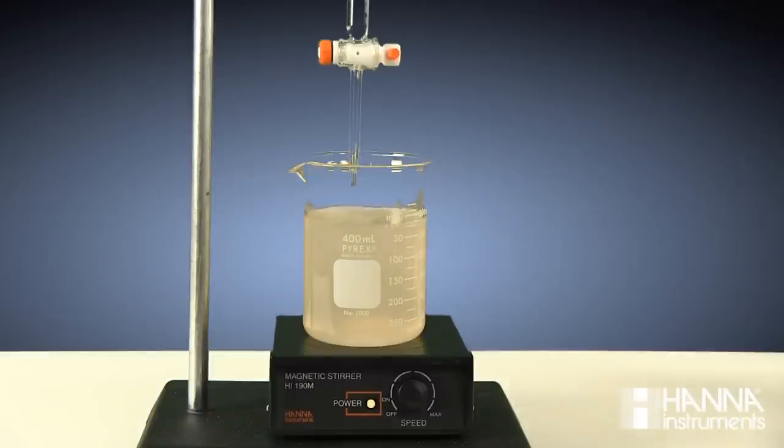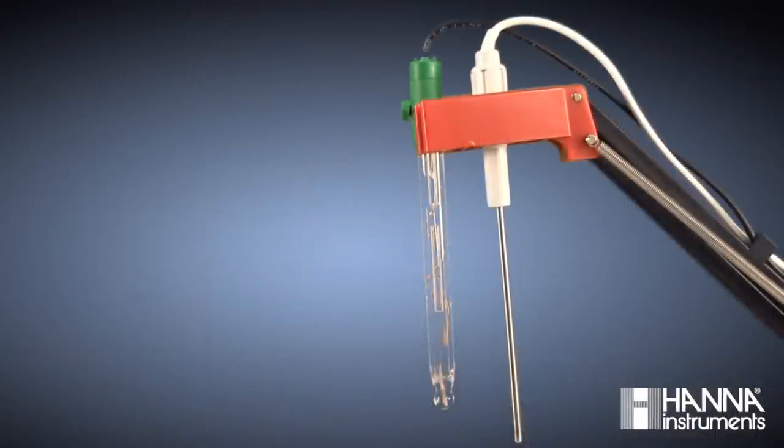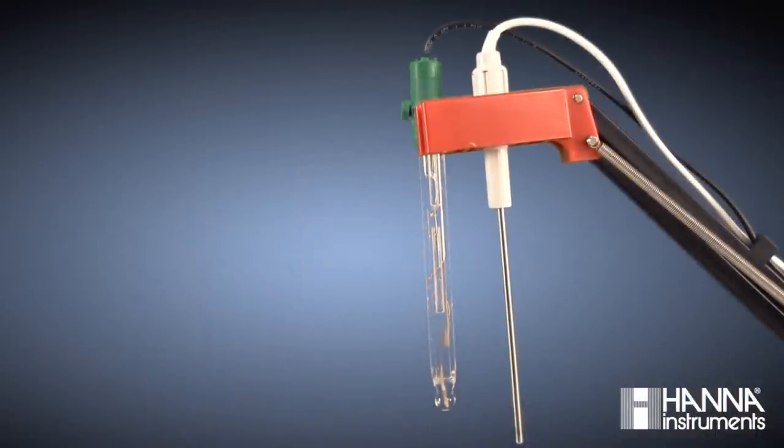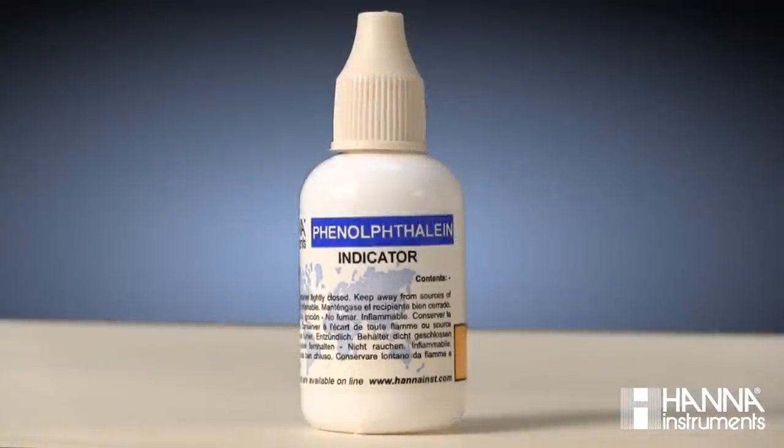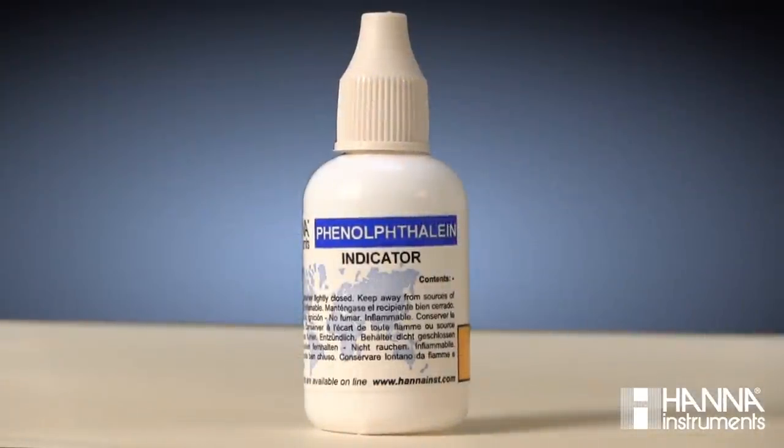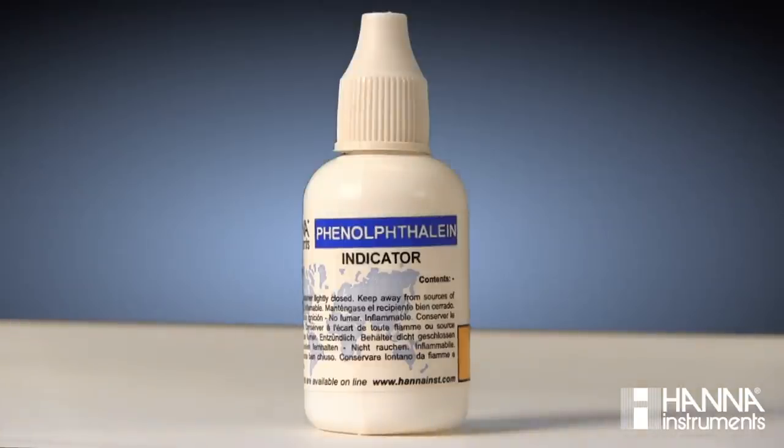We're going to be examining the two most commonly used methods for endpoint determination in a manual titration. These are potentiometrically, with a pH electrode and pH meter, and using a color indicator, which today is phenolphthalein. This method has an endpoint of pH 8.2, which coincides with the point that phenolphthalein changes from a colorless liquid to a pale pink.